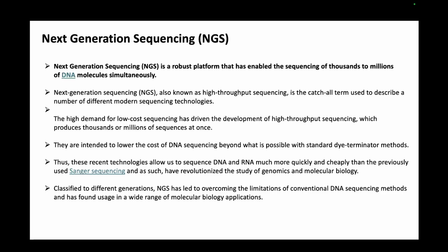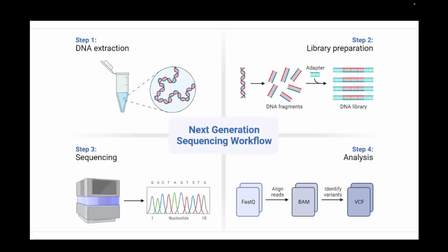So okay, moving on. So this is a general workflow for next generation sequencing.